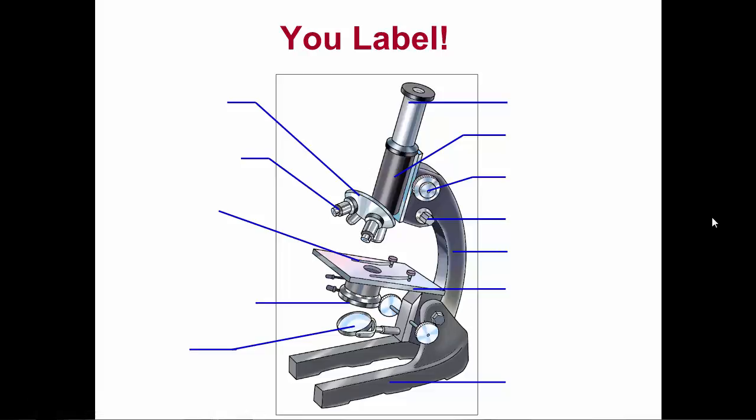Before we can actually use our compound microscopes, we have to talk about how we use them. When we do labs involving the microscope, which we'll be doing several over the next few weeks, often the most common problem is people are not sure how to use them. People always ask questions, like, oh, I can't see anything, or it's not in focus. If we learn how to use them properly, then we can do a better job at finding specimens in the slide and so forth.